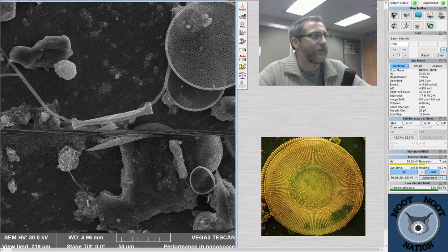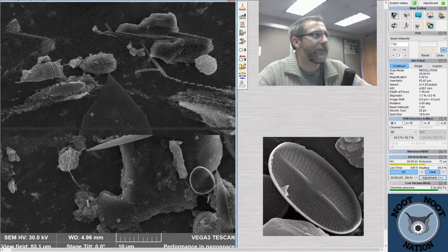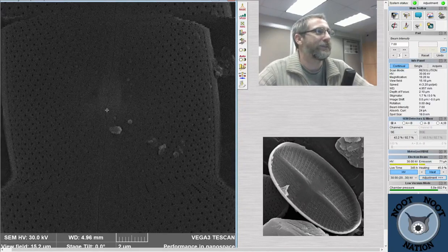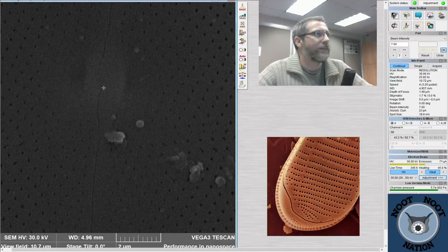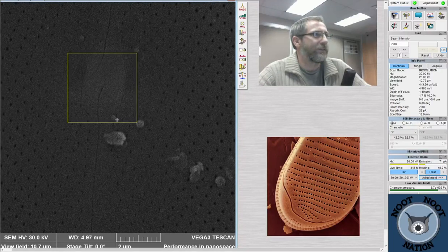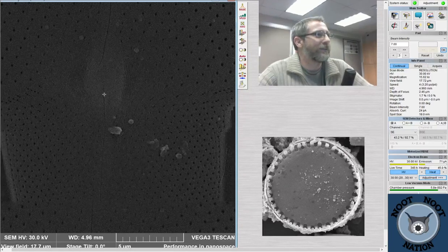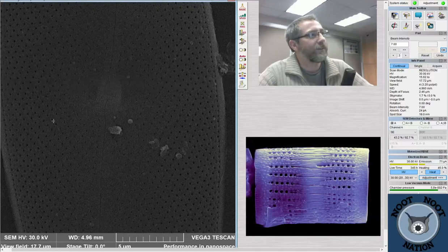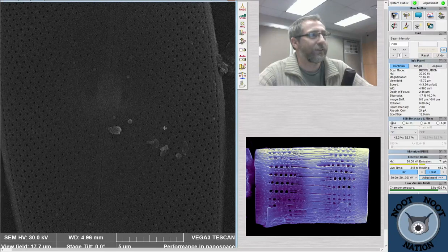And I thought I saw, yeah, there's a Gyrosigma right here. No, it's a Pleurosigma. Pleurosigma, yeah. Sorry, I'm used to the Gyrosigma being more common in the freshwater systems. I'm used to seeing one of these sigmoid shapes and immediately thinking it's actually a Gyrosigma, but it's Pleurosigma. Pleurosigma have decussate-shaped striae there. They form little diamonds rather than forming like a grid.